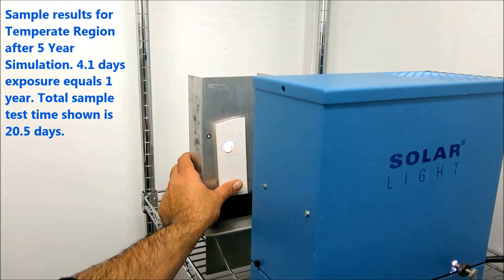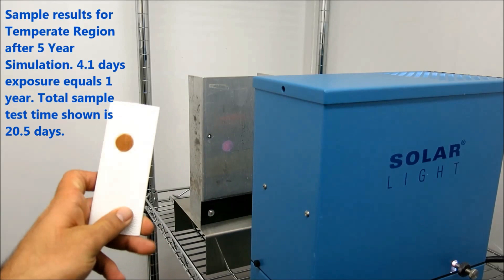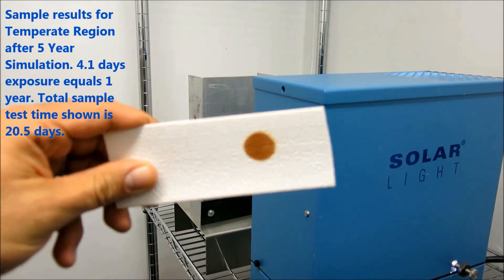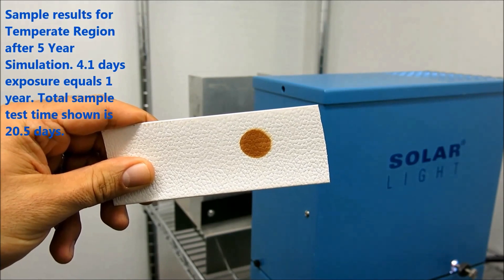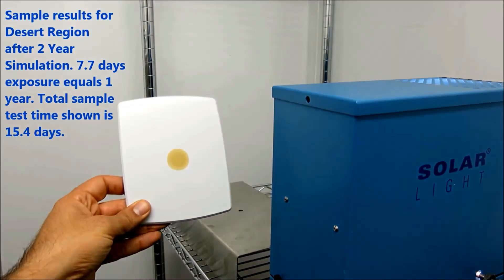We then take the samples and expose them to UV using our precision equipment to your specific requirements. As an option, we can provide a comprehensive report of the test methods and equipment as well as visual observations. Photos and colorimetry data are separate options and can be provided in the report if so ordered.